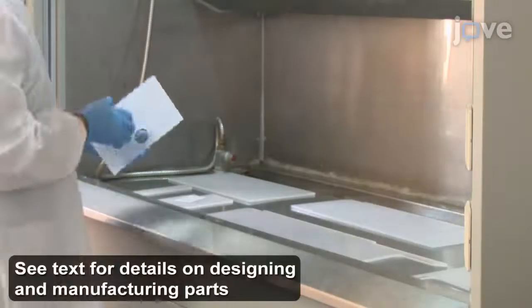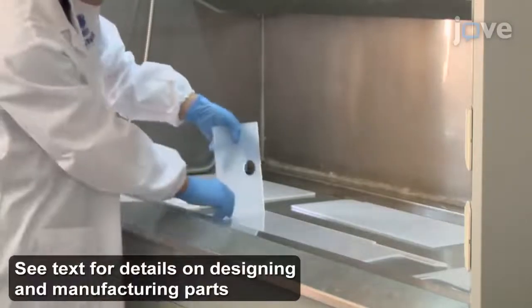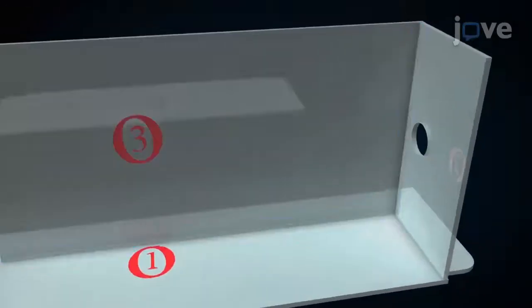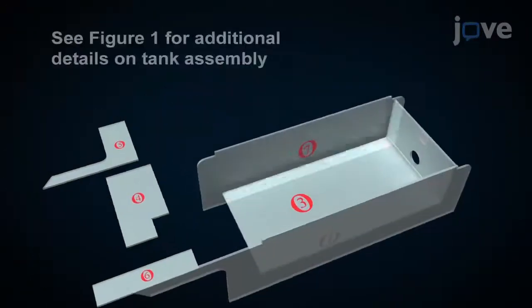To begin, gather all of the pre-manufactured parts in a fume hood. Use chloroform to combine the seven acrylic boards as shown. The end product will be a tank equipped with a section channel and a water bath.